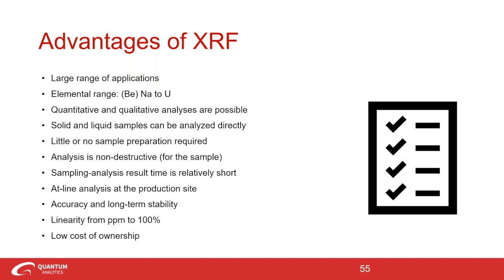But again, advantages, and these are big ones, guys. So you think about what XRF can do for you. It gives you a large range of applications. It does a lot. It has a huge elemental range: for WD from beryllium to uranium, for ED from effectively sodium to uranium for quantitative. You could do both quantitative and qualitative analysis.